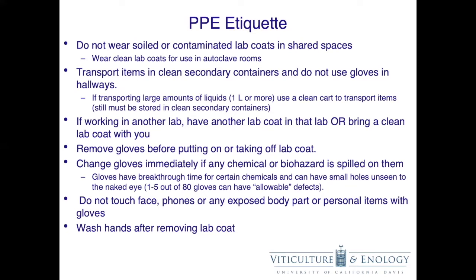Change your gloves immediately if any chemical or biohazard is spilled on them. Gloves have breakthrough times for certain chemicals and can have small holes unseen to the naked eye. 1 to 5 out of 80 gloves can have allowable defects. Do not touch your face, phone, headphones, or any exposed body part with gloves. Doing so can contaminate your skin or personal items with any of the hazards you have on your gloves.